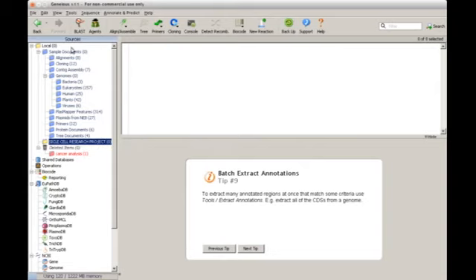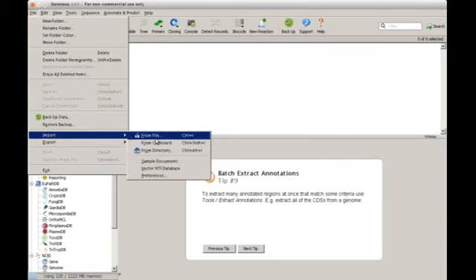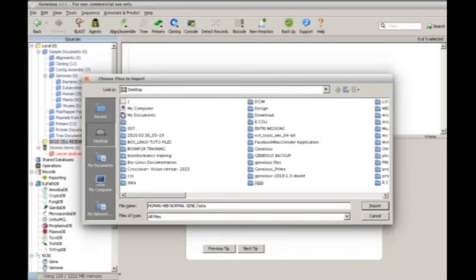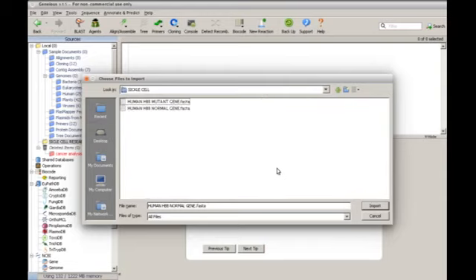So the next thing you will do is import the files, the data you downloaded from the NCBI database. So you click the file option, go down to import. Then you look for the folder you saved those data you downloaded from NCBI. I named my own sickle cell. So here it is, sickle cell. So you click it and you find both data.